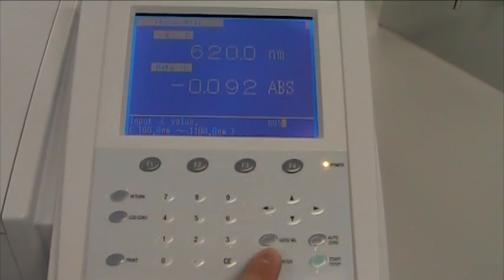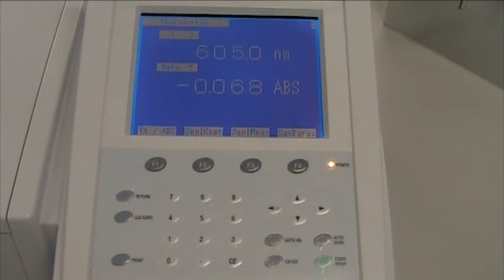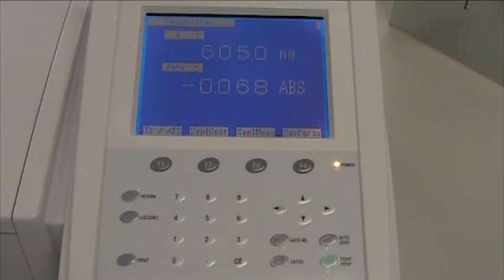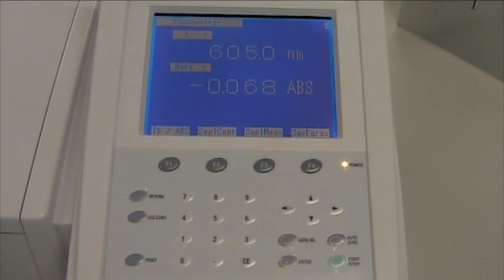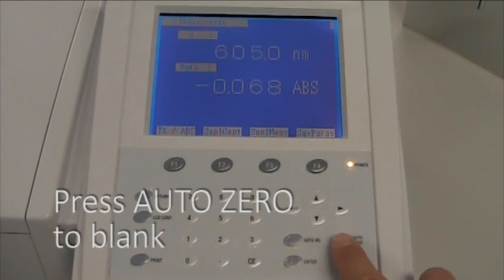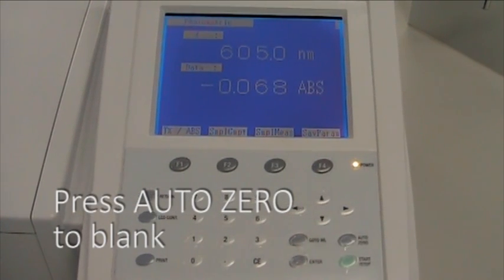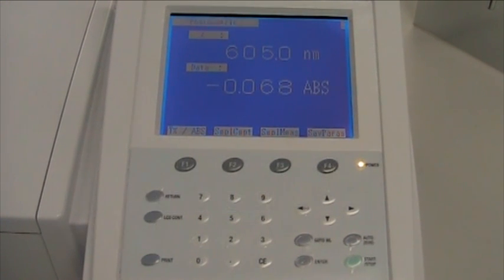Wait until the display shows the new wavelength. To blank the spectrophotometer at this wavelength using the blanking solution you just inserted, press the auto 0 button. Wait until the machine beeps and the absorbance reading is 0.